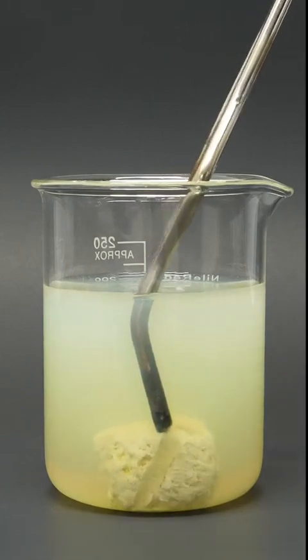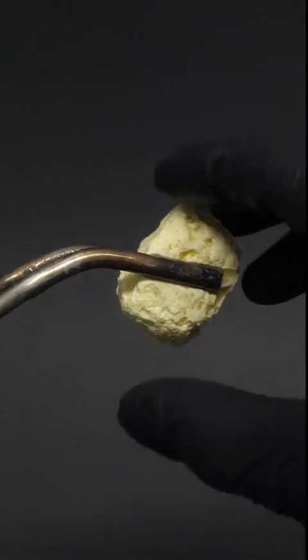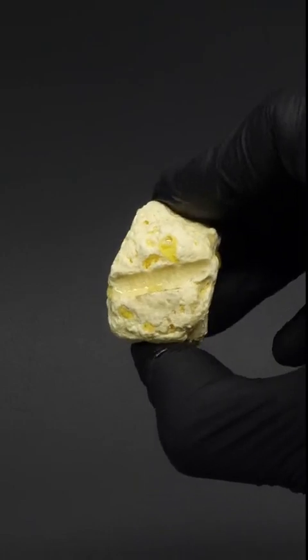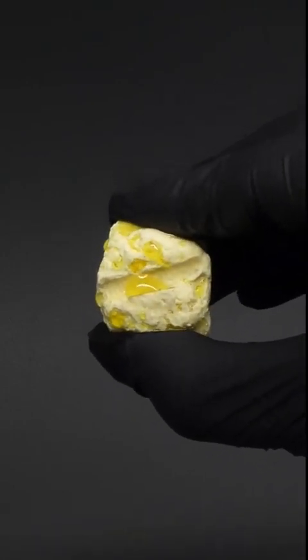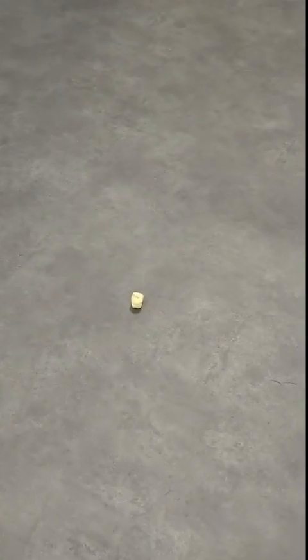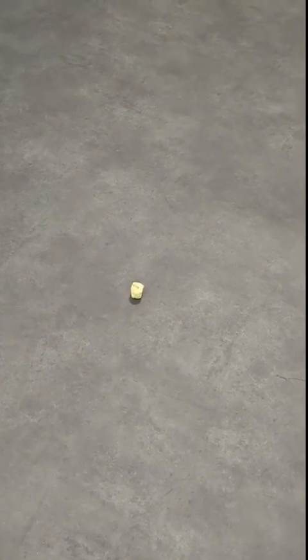So now, after all that work, I have a little rubbery cube. It isn't as round as I was hoping for, but it's still really squishy, and I think it should be able to bounce. Okay, so I don't think I can call it a bouncy ball — it's more like a kind of bouncy cube.